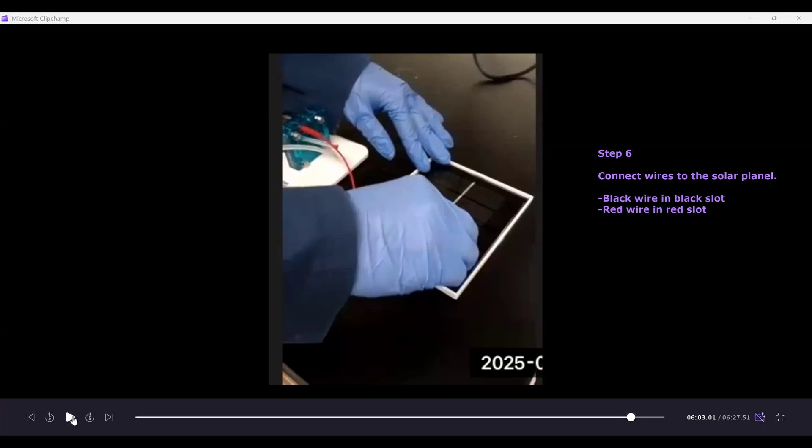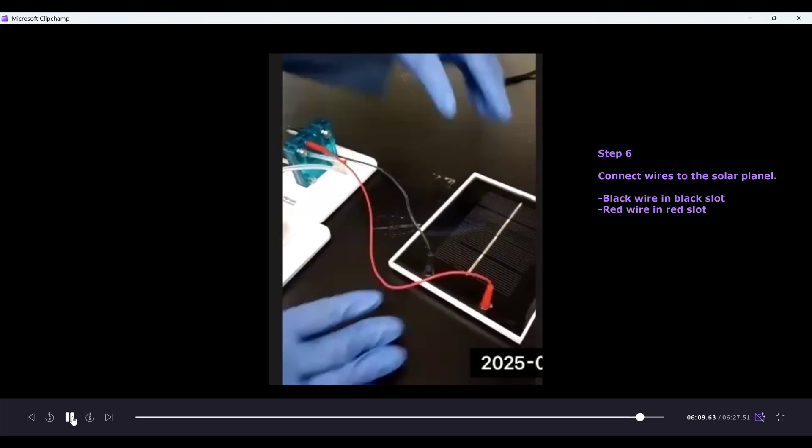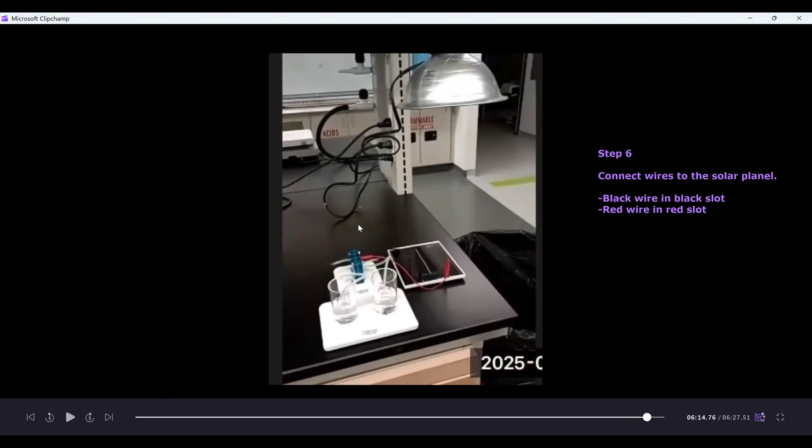The last step is to connect the wires to the solar panel — again color coded, so the red wire goes into the red slot and the black wire goes into the black slot. You now have a fully assembled solar panel setup: the fuel cell, solar panel, beakers with tops to collect the gases, and the heat lamp. I hope this video was informative and you were able to learn how to assemble the fuel cell we'll be using in the Gas Laws Lab. Until next time, Rowdy Chemist Junior signing off.